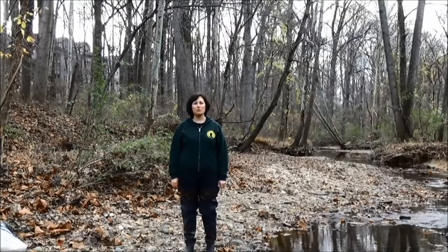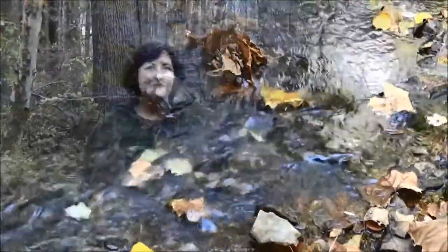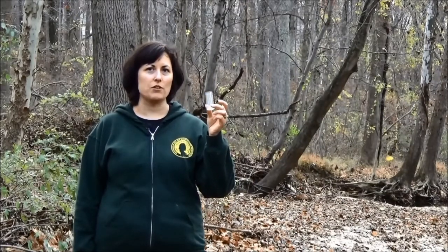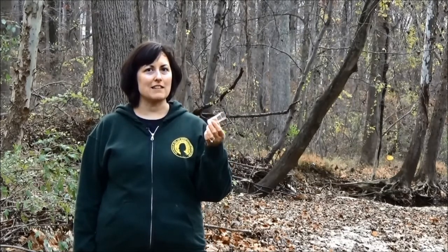Save Our Streams also includes chemical monitoring, which is another way that volunteers can test the quality of the water. For most of your chemical tests, the first thing you're going to do is collect a sample of water from the stream that you're going to use to run the tests. We need to make sure that this is a clean sample.